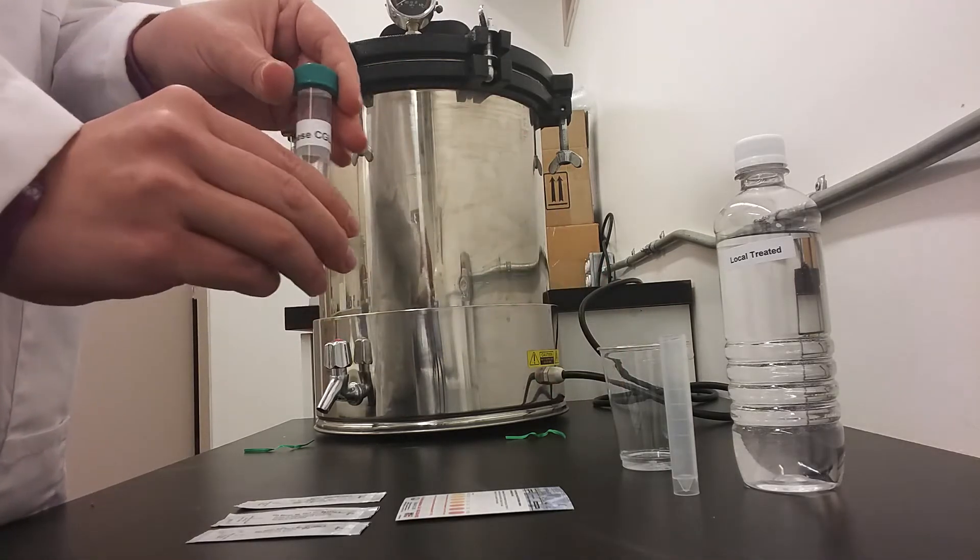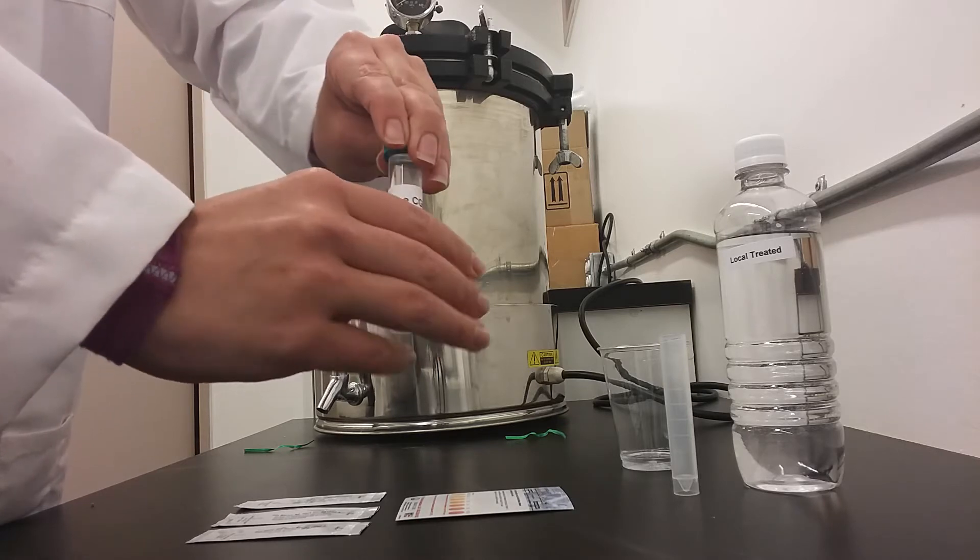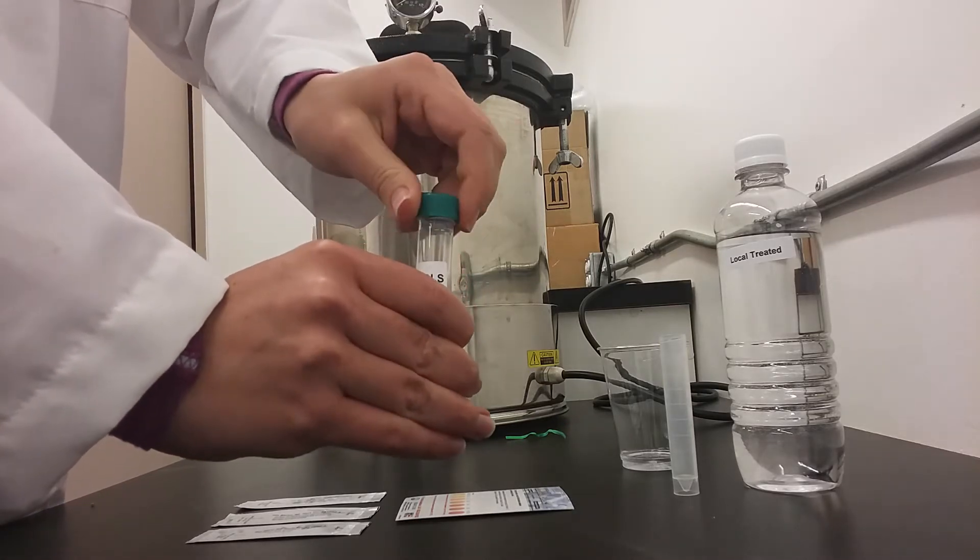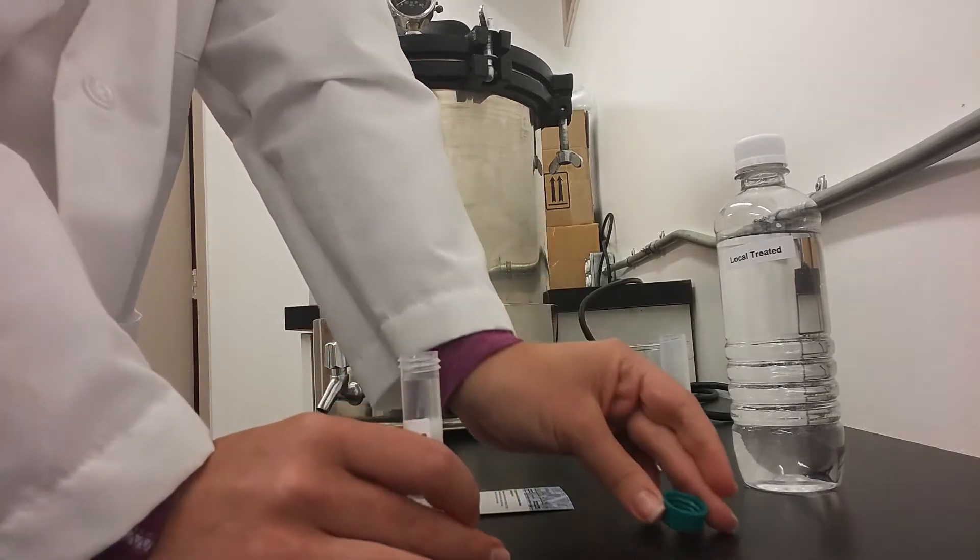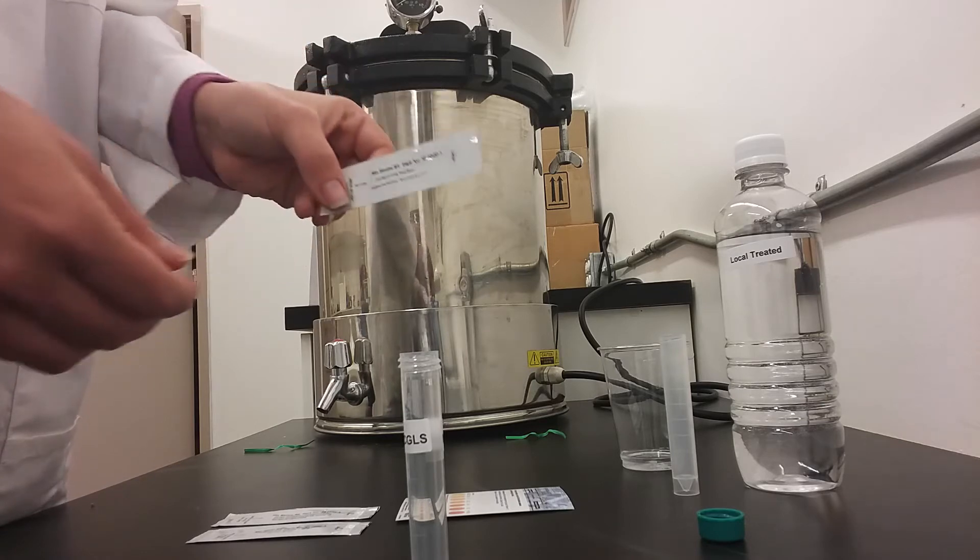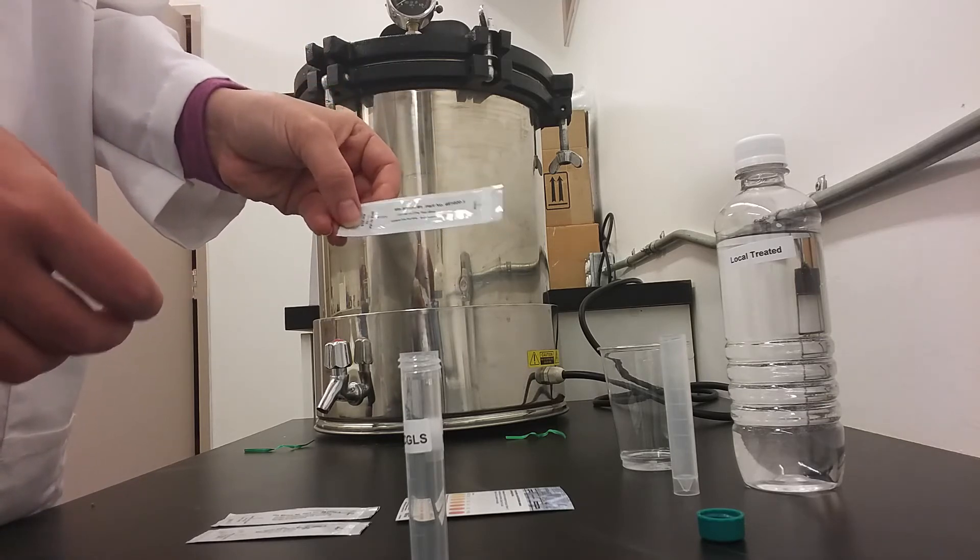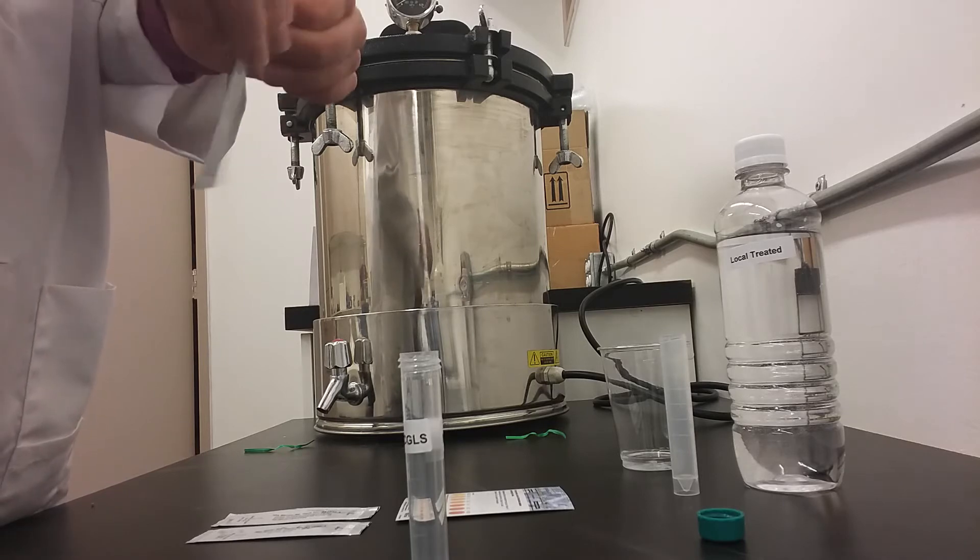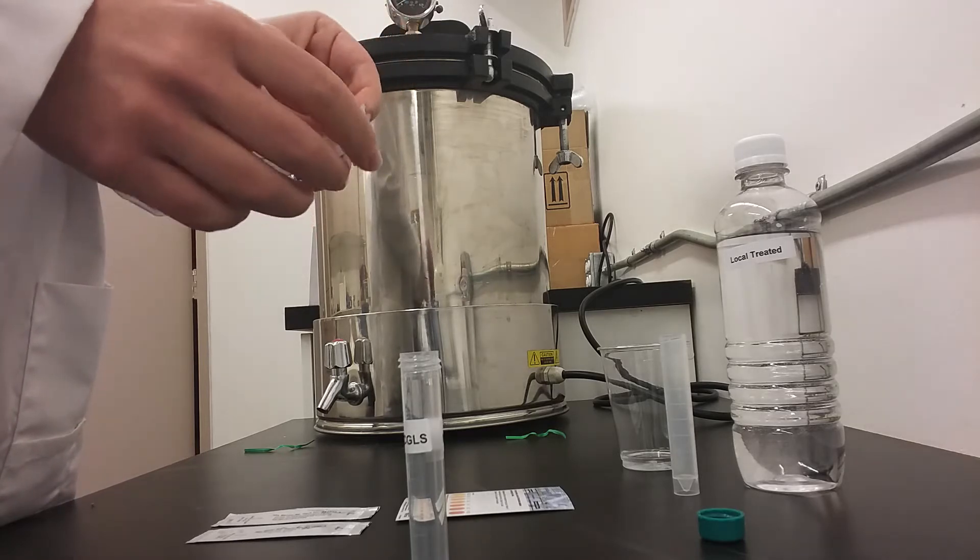The first step is to open the vial of manganese test water. Next you will take manganese strip part 1, opening it carefully from the side that says open.